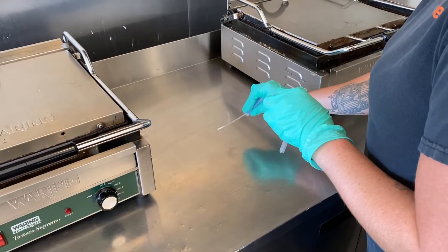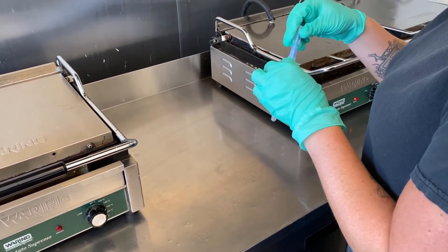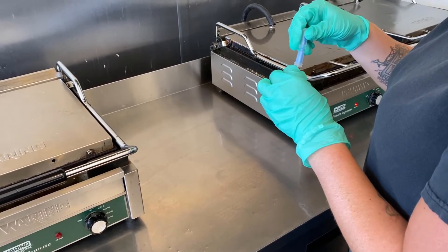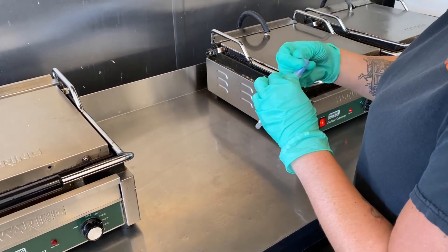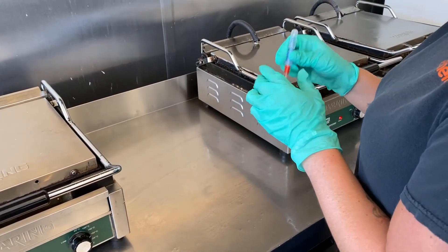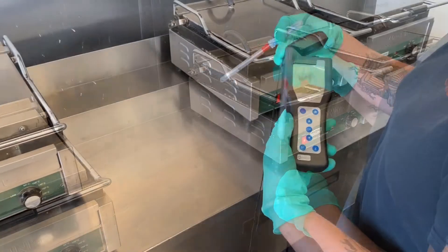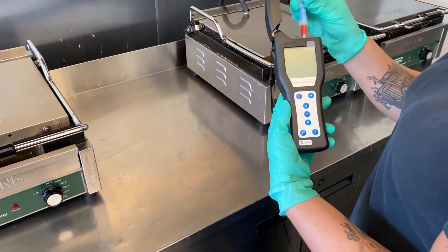After cleaning the work surface, we got her to perform another surface test using a fresh Ultra Snap ATP Surface Testing Swab. We took her through the exact same process as before, breaking the container to release the reagent, giving it a good shake to thoroughly mix the reagent with the sample, and then testing the swab using the Hygiena Ensure Touch.